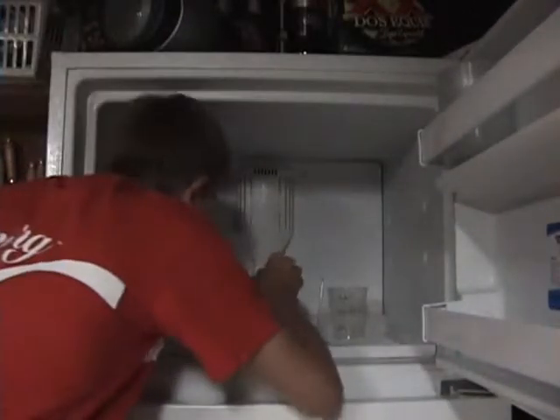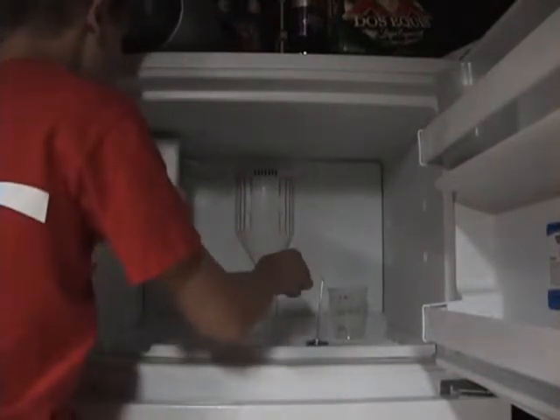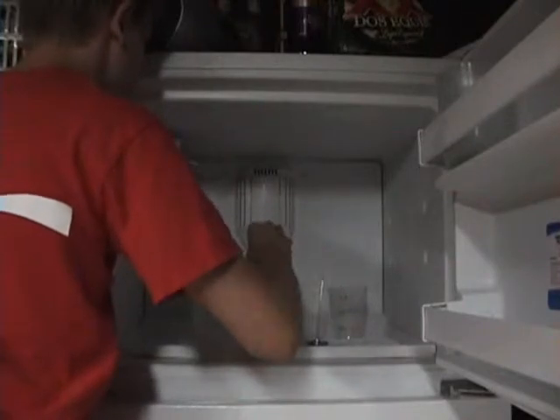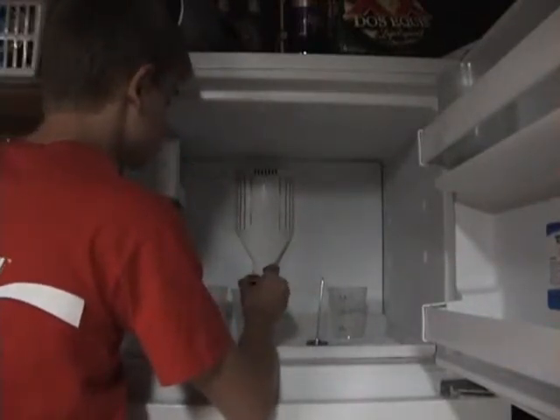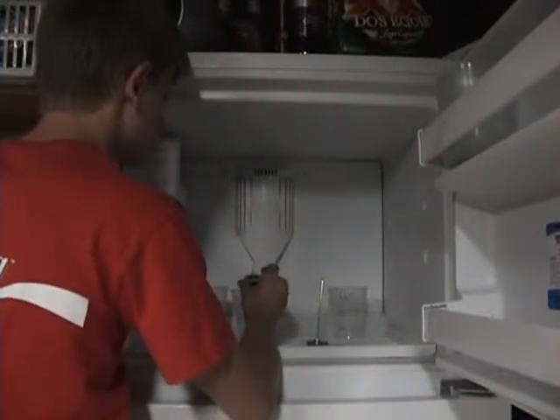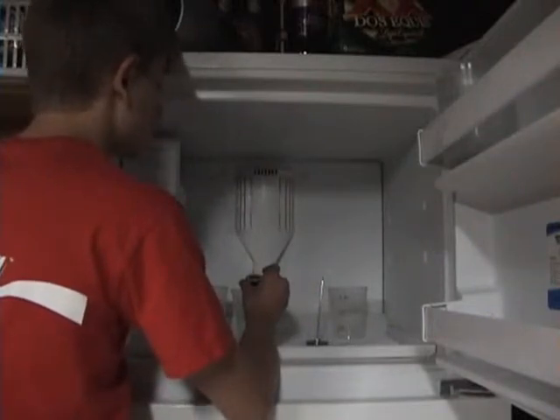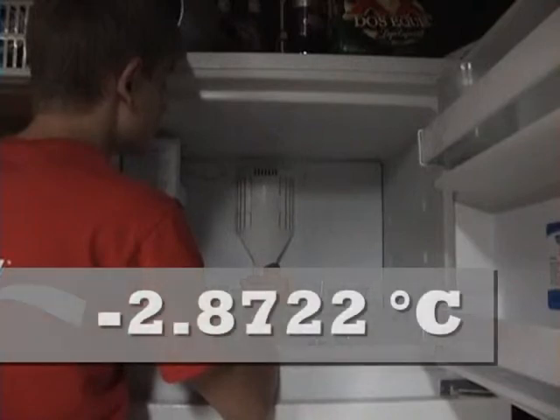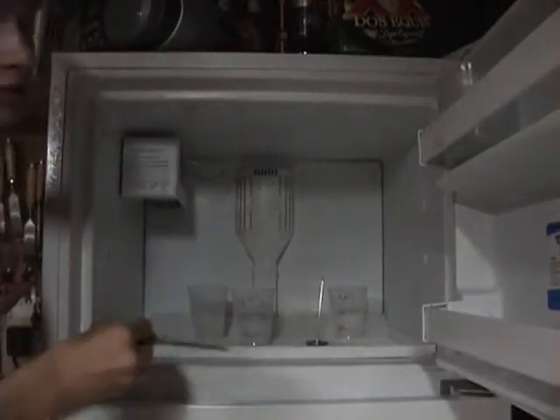Alright, I'm just going to check the solutions again, and the baking soda solution seems to have gotten slushy. It's starting to crystallize and freeze. So let's check the temperature real quick. Yowzers, it is 26.8 degrees Fahrenheit. That's pretty cold.